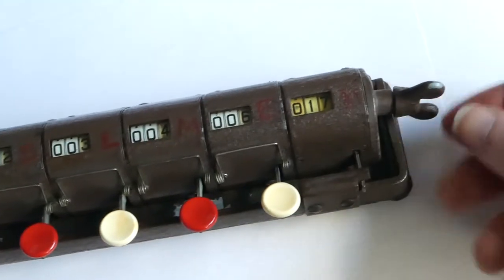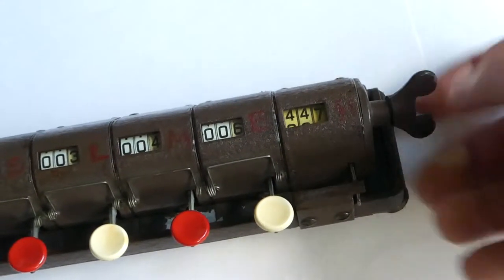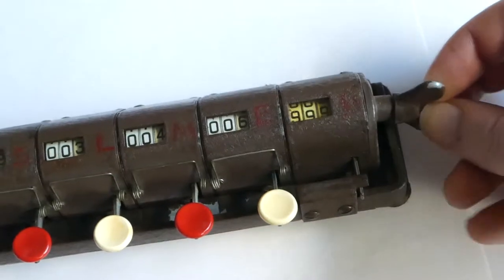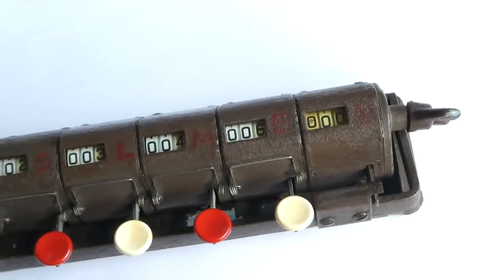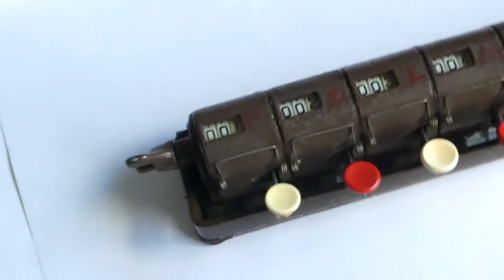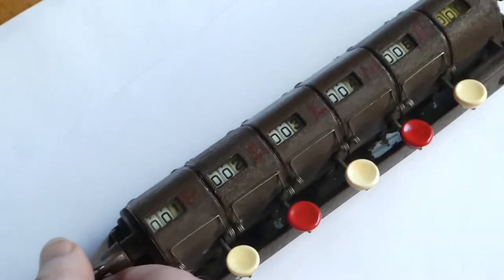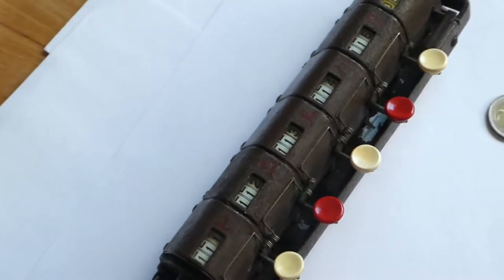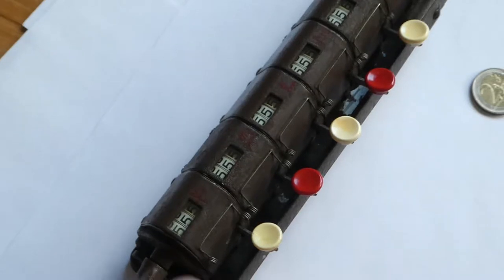This wing nut at the end, that's the clearing mechanism. You have to turn it to zero like that. The wing nut at the other end, that's the clearing mechanism for all five counters at the same time.